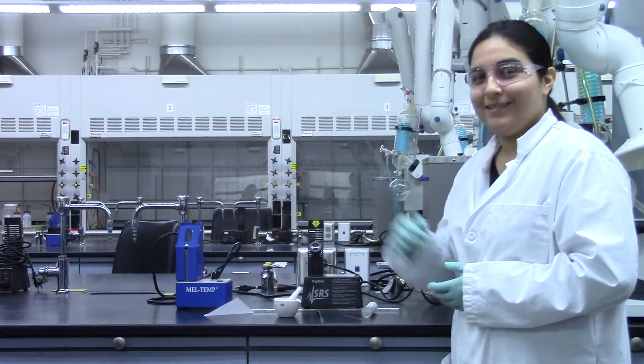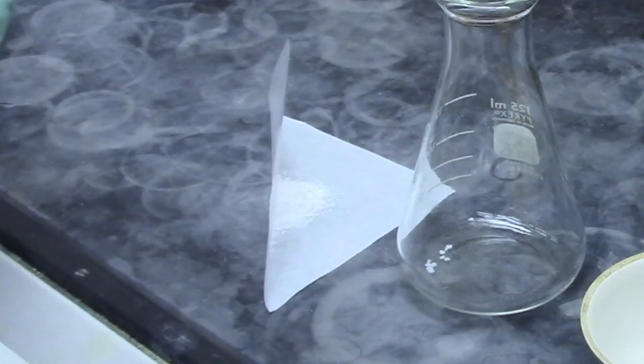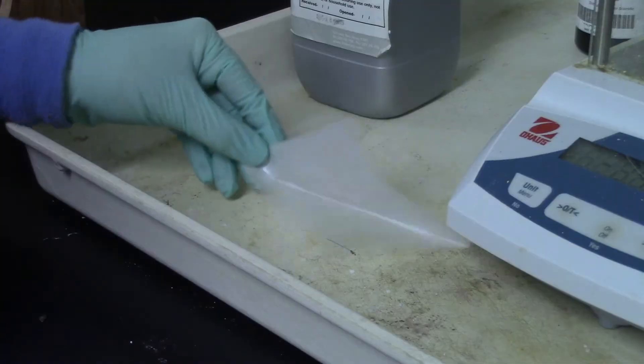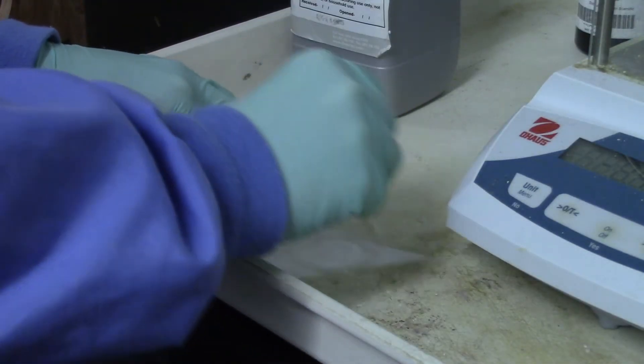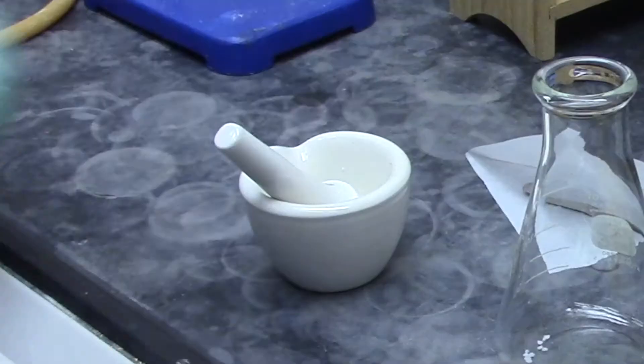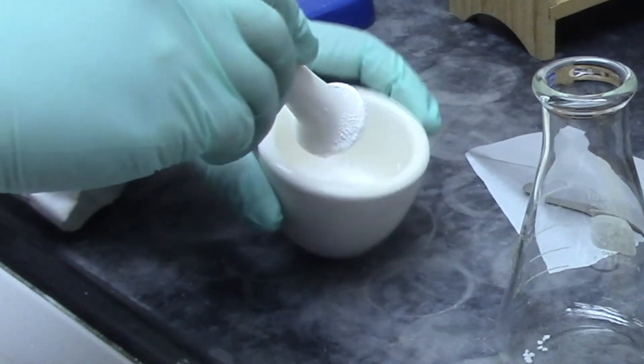To load the capillary tube, the sample must first be crushed into a fine powder. Place some of the crystals onto a piece of paper and use a beaker to grind them. Alternatively, the compound can be crushed in a mortar with a pestle.